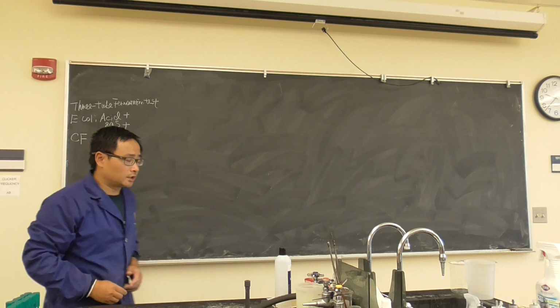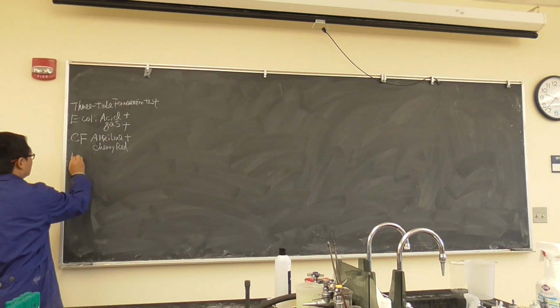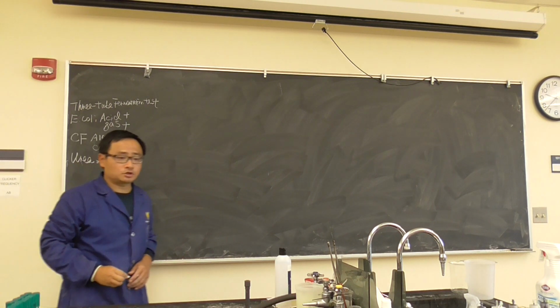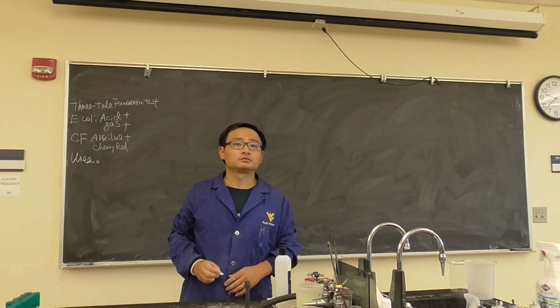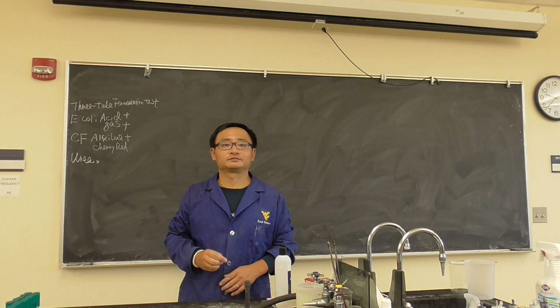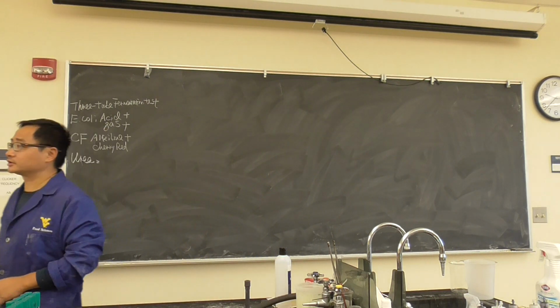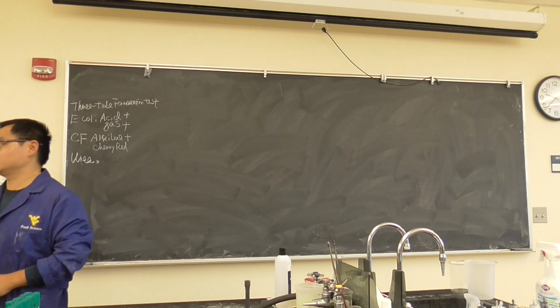If you can see it, and if you see the urea test, who has a Citrobacter? What does the color look like? Can I see the urea tube? Is that positive or negative? Negative. Yes. Whose urea tube is positive? Does it look like it changed color? Yeah, that was positive.